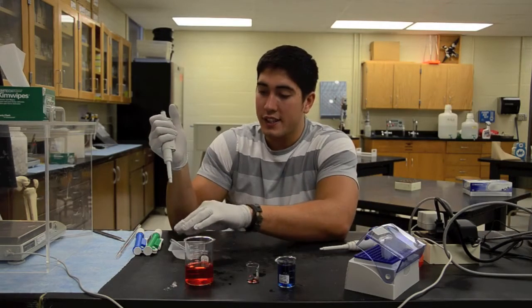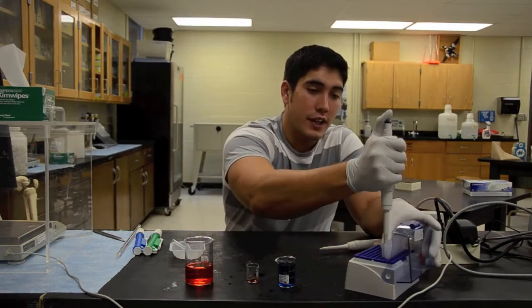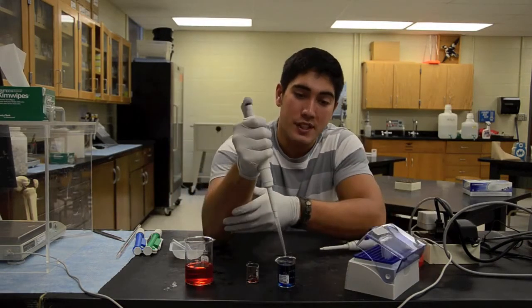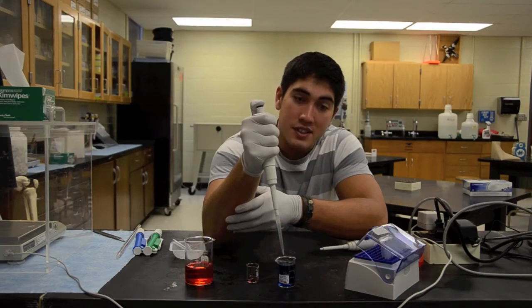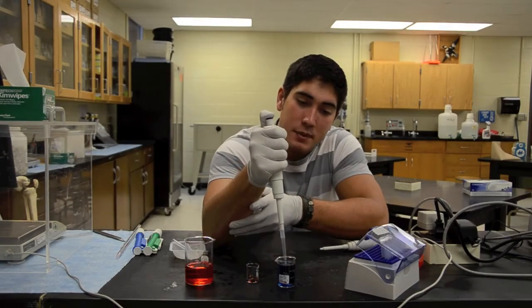Now we eject it into our boat. Get our second one for when we want to go into this beaker. Notice how I'm using sterile technique, using a different pipette tip. Make sure not to touch the sides of the beaker. 700 microliters into that tip.